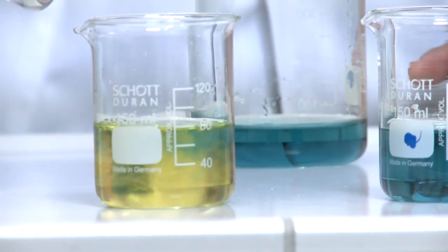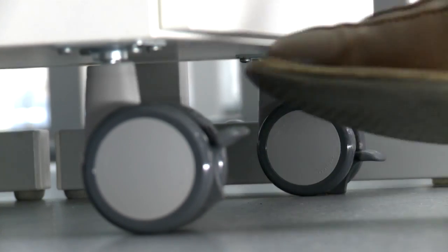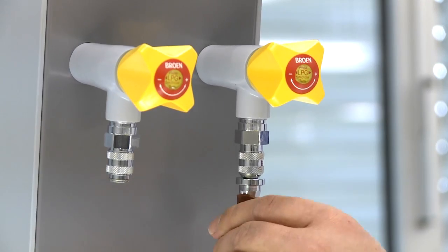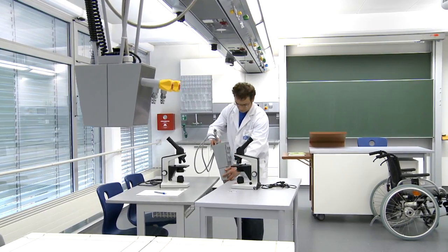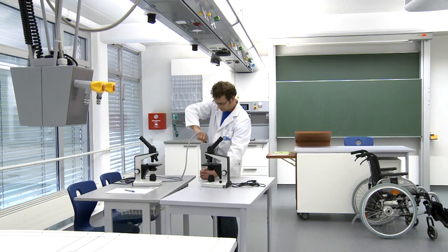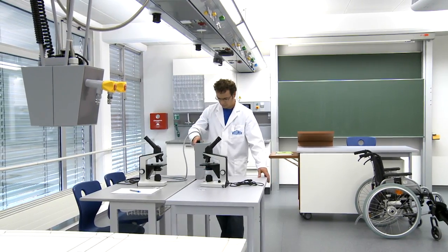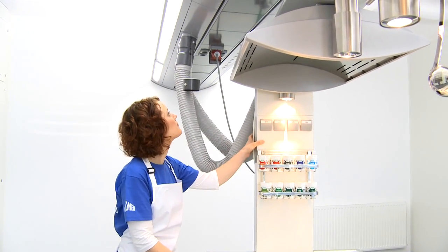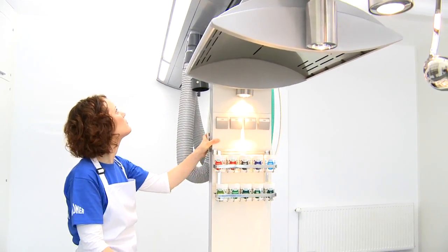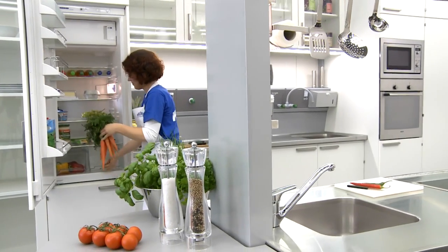Your requirements for subject teaching under the most modern conditions for the greatest possible success in learning. Waldner School Systems' core competence is expressed in the unique character of its products, with a combination of durability and upgradability provided by a modular system that meets all technological and pedagogical requirements.